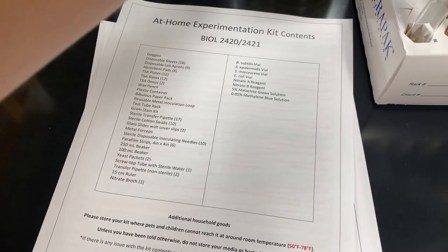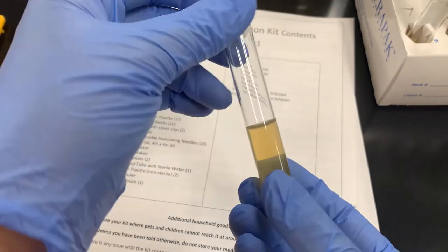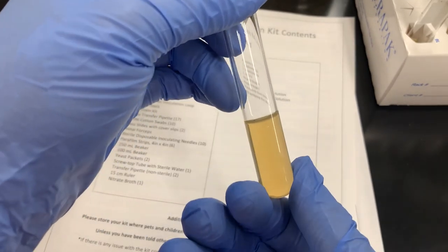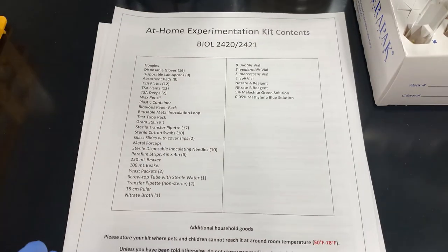Next is agar deeps. These deeps do not have the slant part. They are just agar. You're going to use a disposable needle to stab down in there just so you get a feeling for what stabbing a deep is like. You get 2 of those.